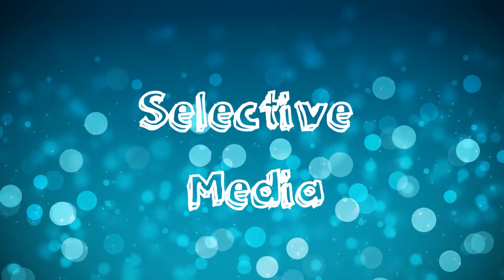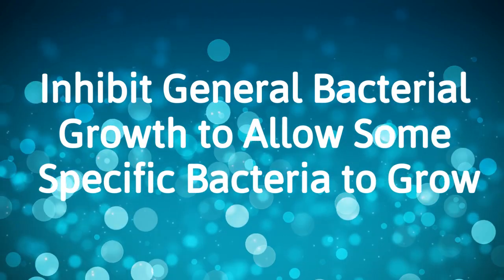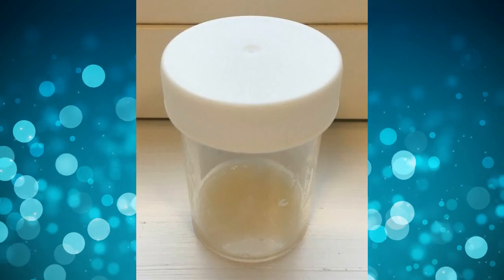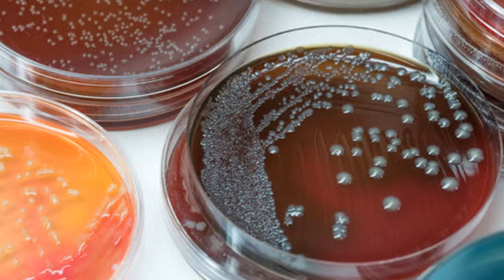Selective media are the ones that contain agents to inhibit the growth of common microbes and allow some specific microbes to grow on them. They are important in primary isolation from samples like feces, saliva, skin, water, and soil where we have a large number of commensal bacteria. They speed up isolation by suppressing the unwanted background organisms and favoring the growth of desired ones.